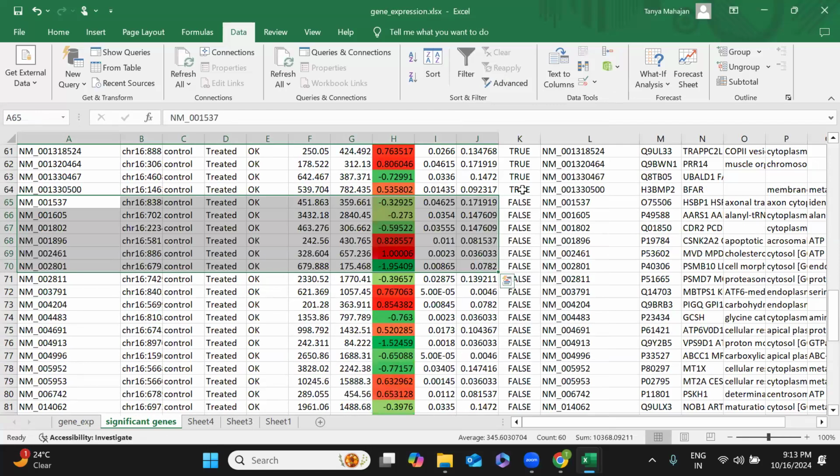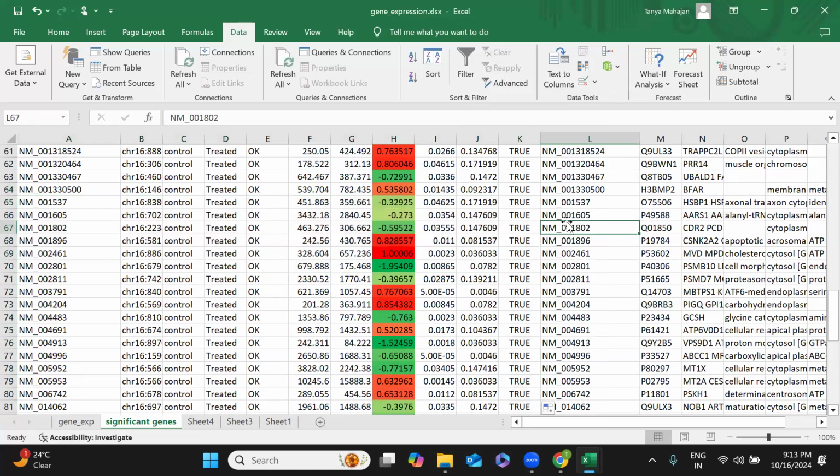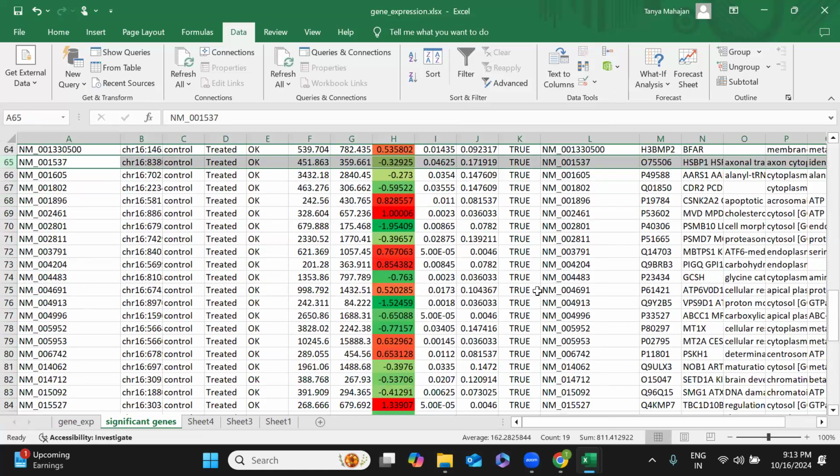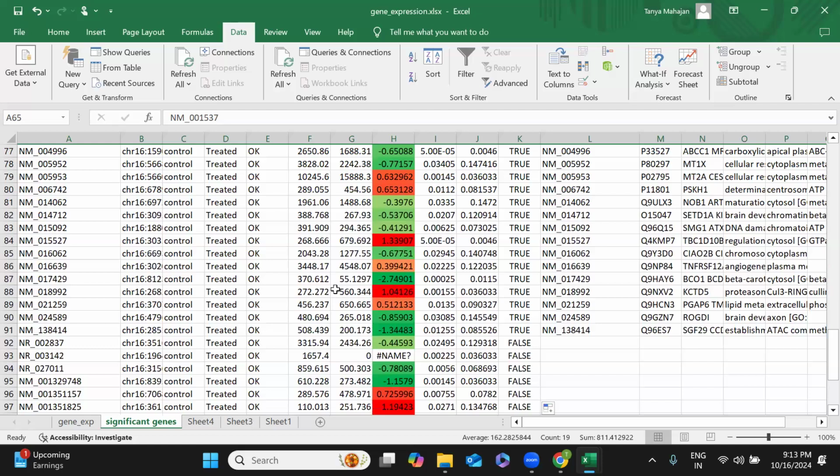Now again you have to go select true and autofill it. Now again see the IDs are matching. Can you see that? Done? Yes, ma'am. Now scroll down. Now can you see for your data, total 91 entries, you got the complete information. Can you see that?